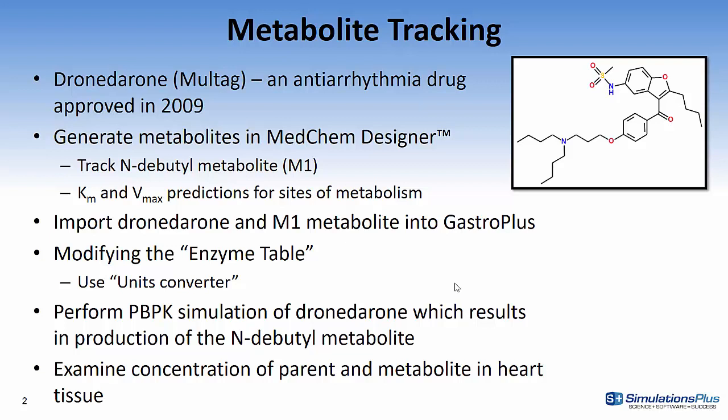I'll first generate the metabolites in MedChem Designer and show that we're going to track the N-debutyl metabolite. I'll also show KM and Vmax predictions for the sites of metabolism in MedChem Designer. Then I'll import Dronedarone and the M1 metabolite into GastroPlus and modify the enzyme table of Dronedarone to extract out the kinetic parameters for this metabolite so that we can track it.